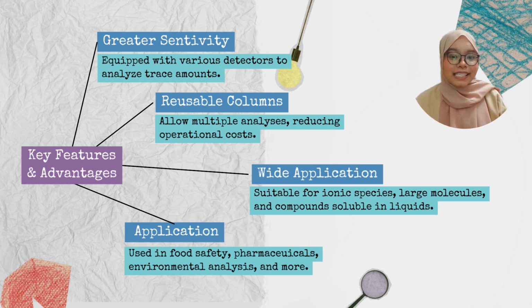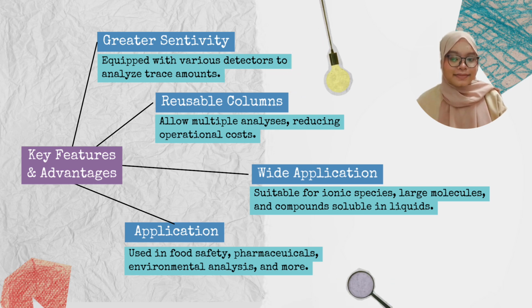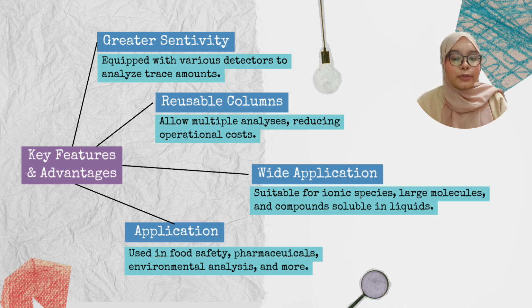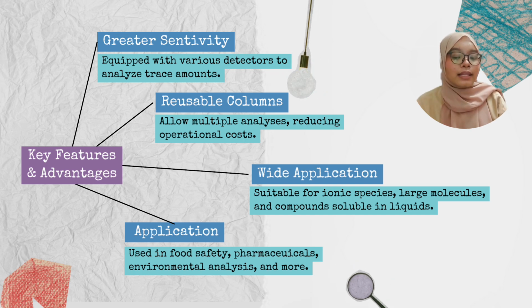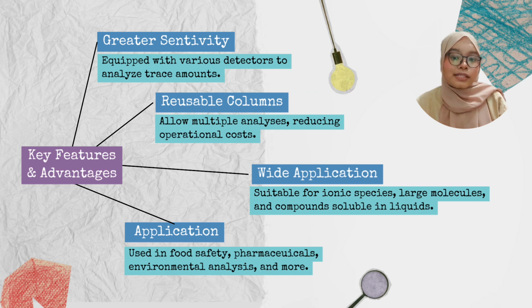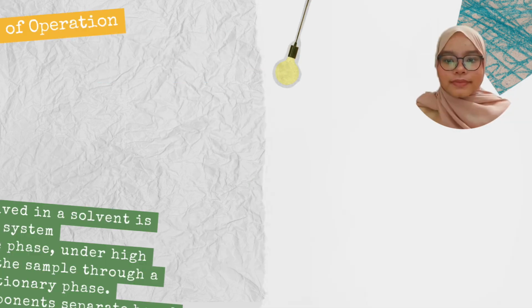Finally, let's look at its practical application. HPLC is widely used in food safety, pharmaceutical, environmental analysis, and much more. It is a critical tool across multiple industries.